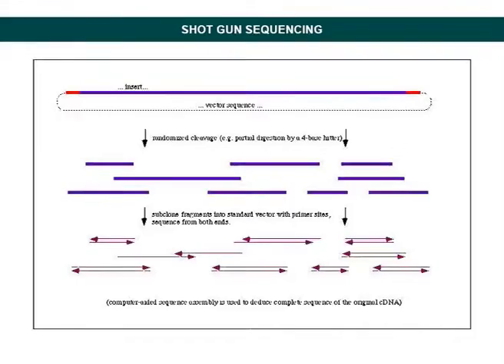at once. Shotgun sequencing is well established because of the availability of the cloning vectors, fluorescently labeled primers, and software for base calling and sequence assembly. A simple diagram of shotgun sequencing is shown in the figure.